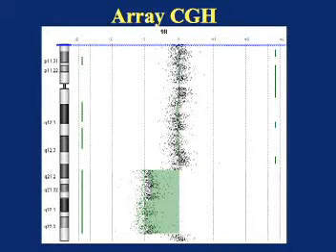Although this is an amazing technology that can help us move the research forward at a much faster pace, this technology too has its limitations. All the data points are shown against the map of the chromosome. This is not a picture of the chromosome. This can be illustrated in this example.